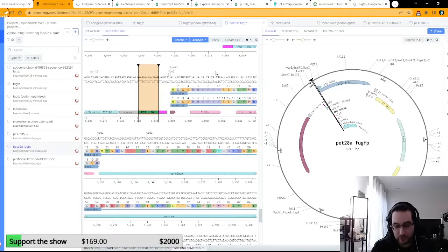Are there any software aside from Benchling that you would recommend? It sort of depends. I don't really use much else. Genome Compiler was great, but it's been relegated to oblivion, so it's not functional anymore. I hate SnapGene. Don't use SnapGene. It's expensive garbage. It's not worth it. I don't really use a lot of other software.